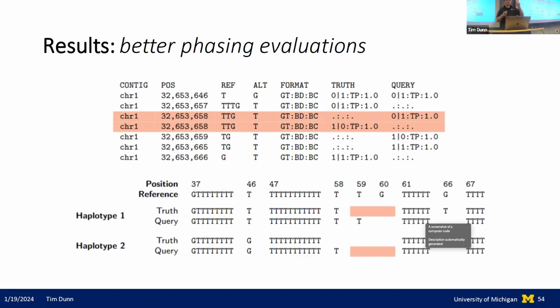So even though if you consider just the individual variant representations, it really looks like there's a flip error here, once you take into account all the surrounding variants, it's actually just the variant representations that differ. And the two sequences that they report are exactly the same.